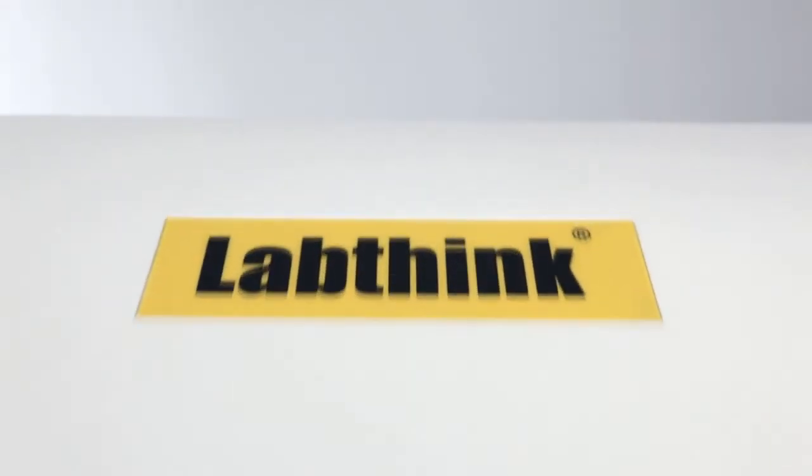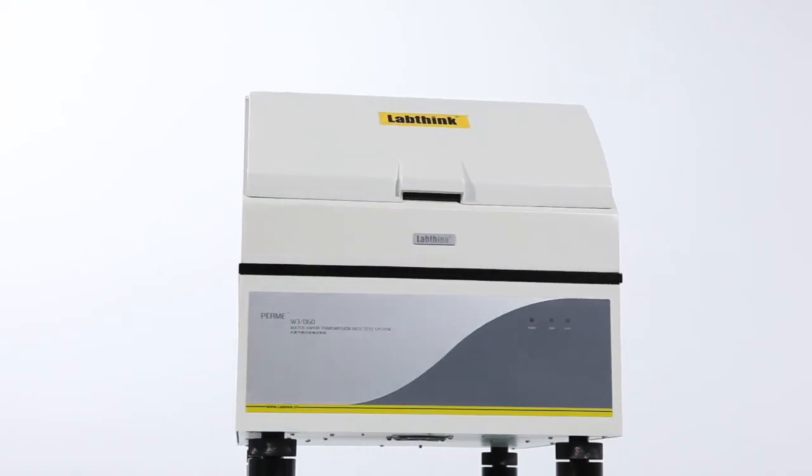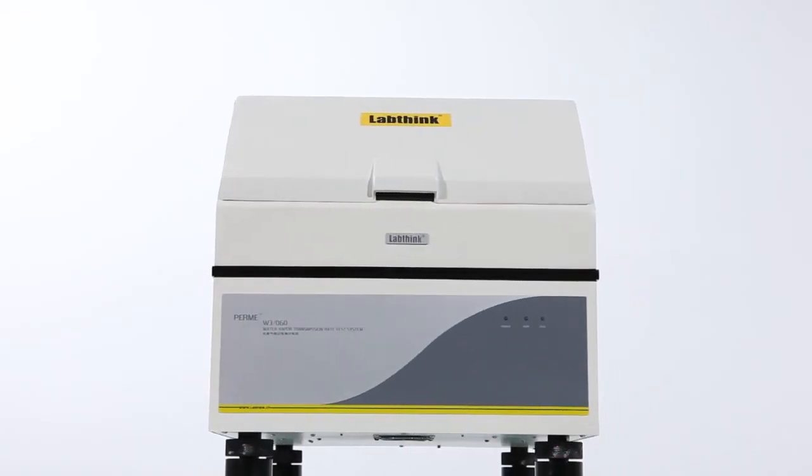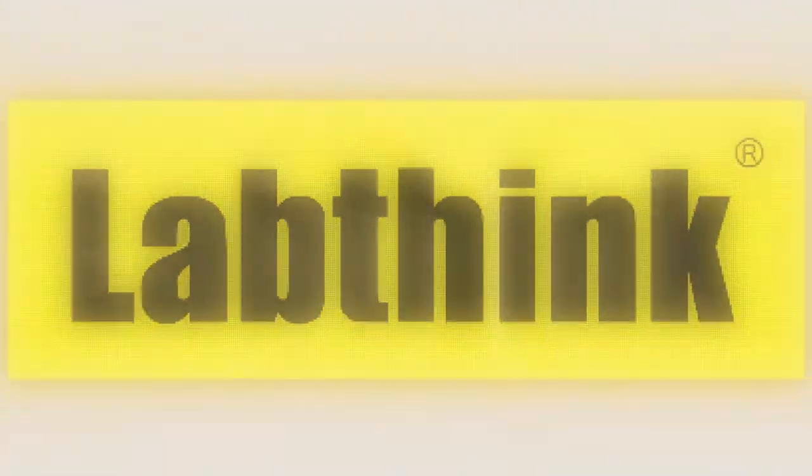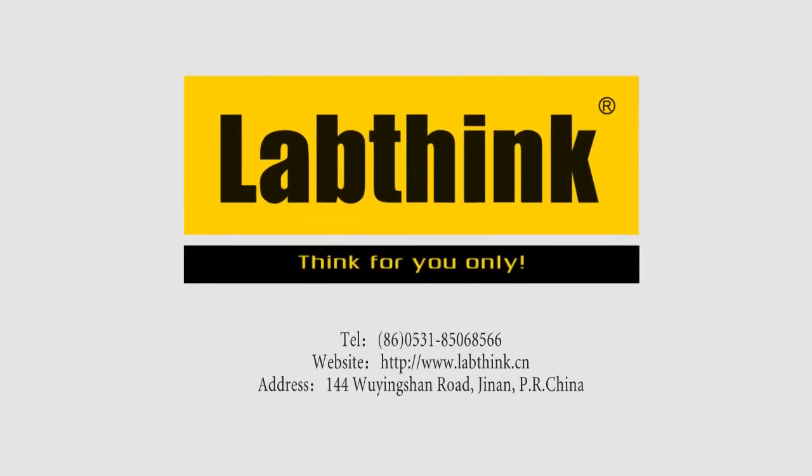W3060, your excellent choice for water method WVTR testing system. LabThink, think for you only.